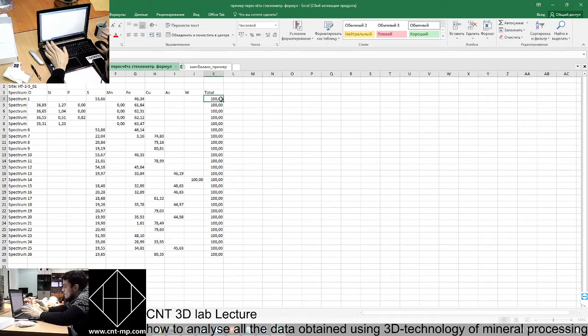Also, I forgot that sometimes analyses are bad. How do we check whether an analysis from electron microscopy is good or bad? We can check the sum of the contents of various elements. So if you see 100% from electron probe microanalysis, let me say the abbreviation again, EPMA, okay, EPMA.